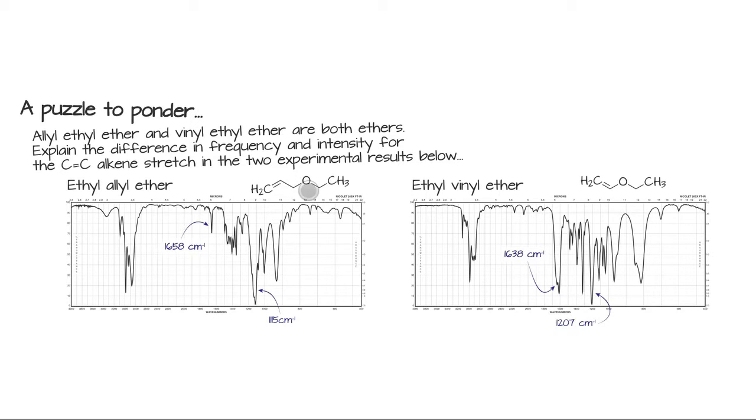Why is that? Here I've got the carbon-oxygen stretch, a typical region there, 1100. Here I've got the carbon-oxygen stretch, also a typical place, but it's a lot higher, 1200. Why does the fact that this is conjugated lower the frequency of the double bond and raise the frequency of the single bond so much? As you answer that for yourselves, consider enolates, consider how vinyl ethers are electron rich and good nucleophiles, and review your organic chemistry with an idea of nucleophilic double bonds. And usually that's, of course, because they've got an oxygen attached to them.